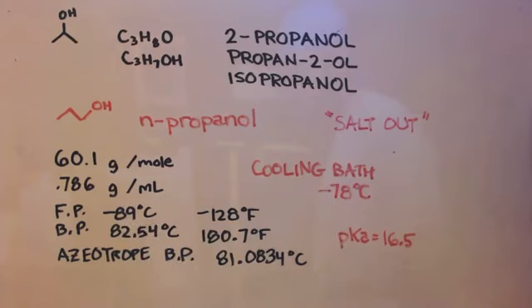You get your dry ice, which is frozen carbon dioxide. You can get it at the grocery store or a place that does beer. They make beer and stuff like that. You'd have to look in the phone book or whatever, someplace close. This is expensive where I'm at, so I don't really buy it. But you can get chunks of it.